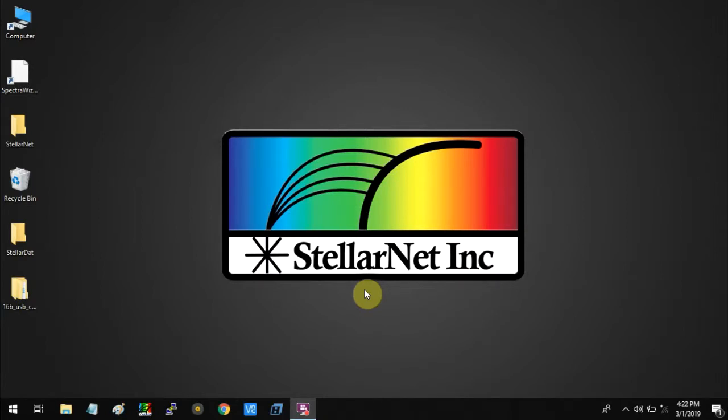The SpectroGase mobile app consists of apps such as Spectroscopy, Colorimeter, Radiometry, and Concentration. These apps are pre-installed on the onboard CPU in ZAP2 and the Smart Control box.